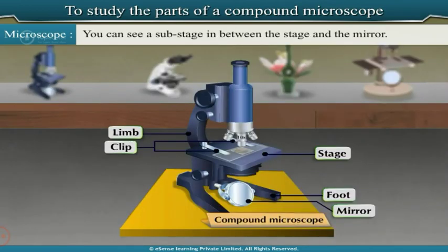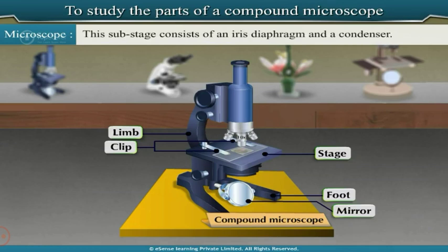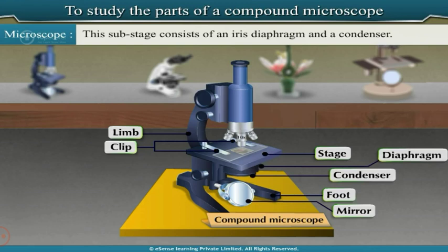Between the stage and the mirror is a sub-stage, which consists of an iris diaphragm and a condenser. The iris diaphragm is a wheel-shaped metal disc that regulates the size of the aperture.